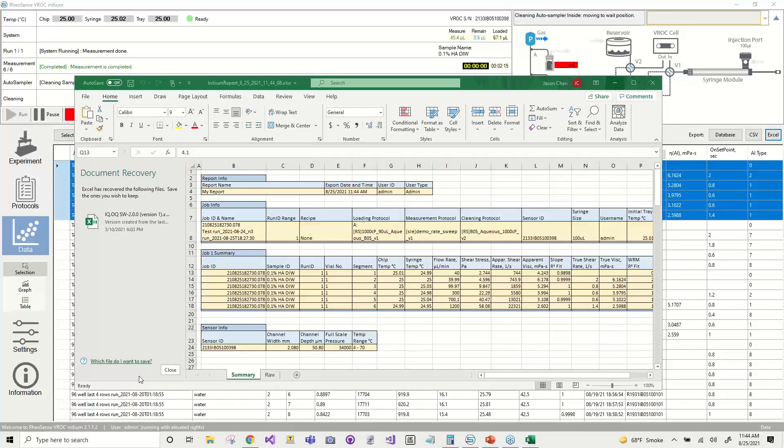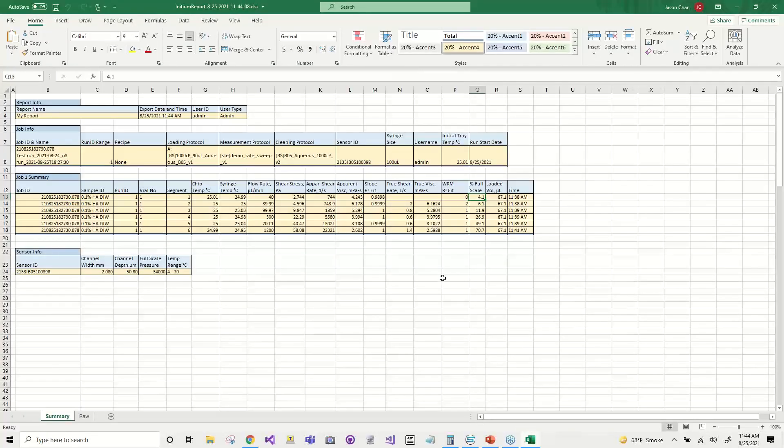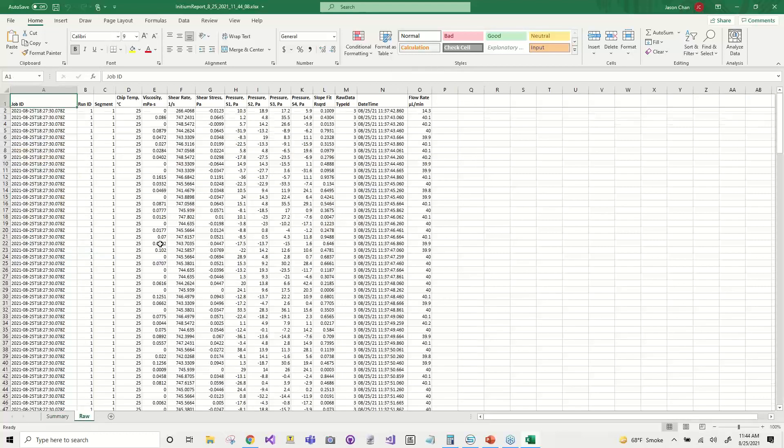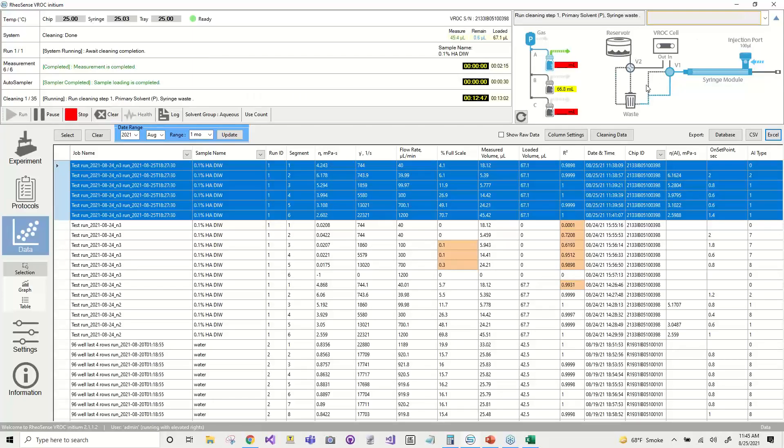Here's what the data would look like in Excel — this is the table we saw in the Initium software. If we go to the raw data tab, we can look at the data for each individual data point. So if you wanted to work with your data in Excel and manipulate it, you can do that here. Another data export option is exporting the data as a database. If you do that, you can use our separate analysis software called Clarity to further work with your data and manipulate it. You can also perform intrinsic viscosity analysis and estimate injection forces in Clarity as well.